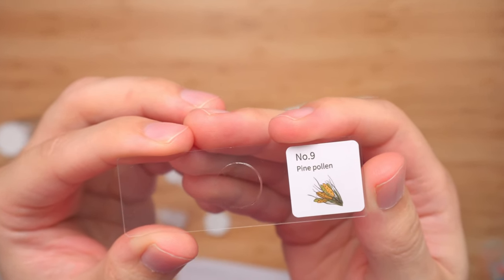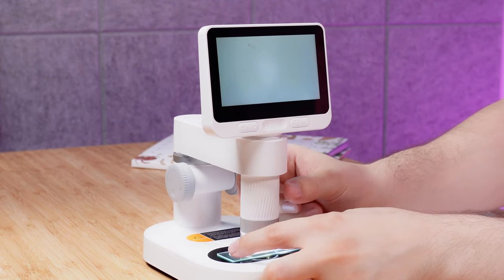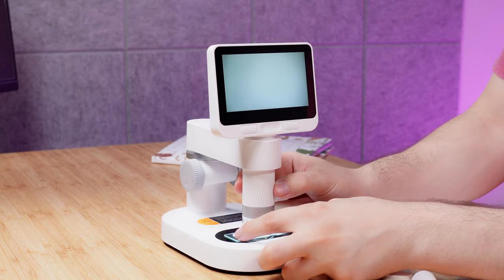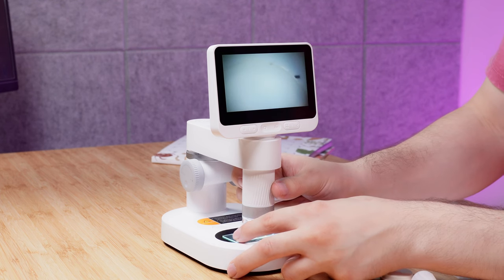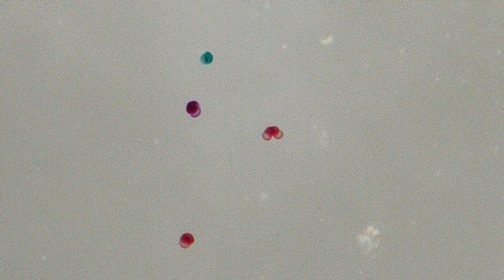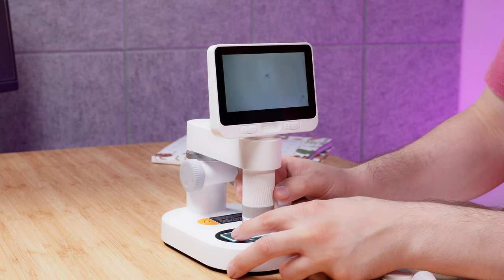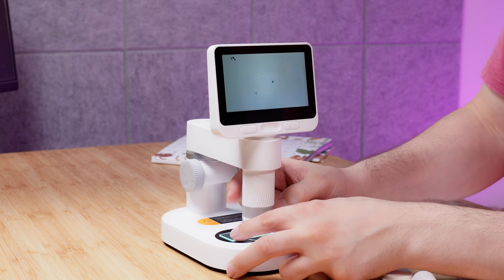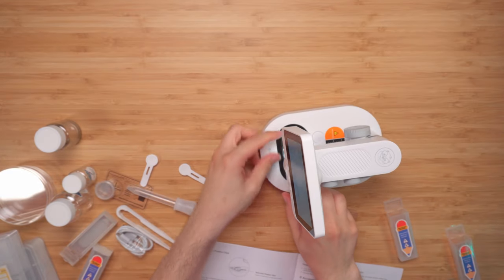Now we have the pine pollen. I was having a little bit of a hard time finding it, so I zoomed out to get a better chance to pinpoint it. I can kind of see some little colors there, so I'm assuming that's what we're going after — and yes, that's the one.